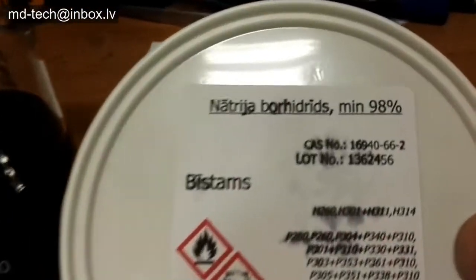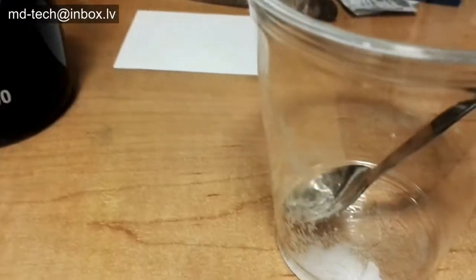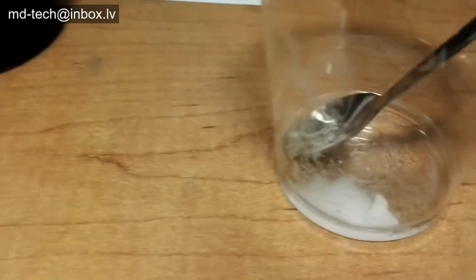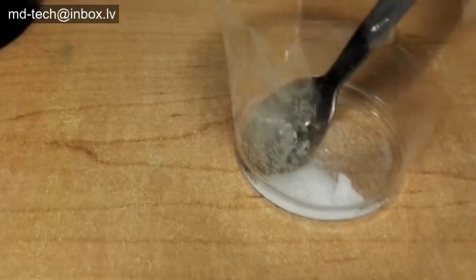I use sodium borohydride. It releases hydrogen gas when dissolved in water. Decomposition is about 3 hours. If adding sodium hydroxide to the water solution, stability is up to 12 hours.